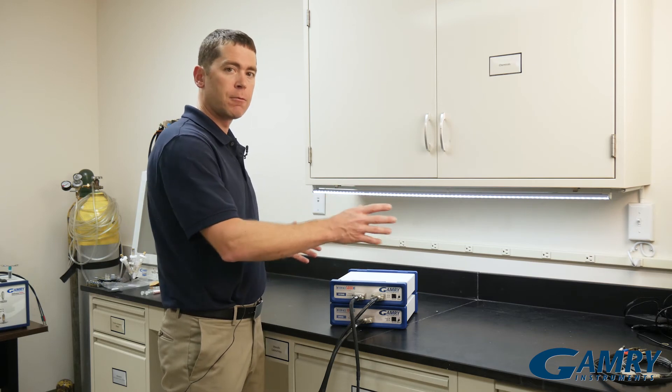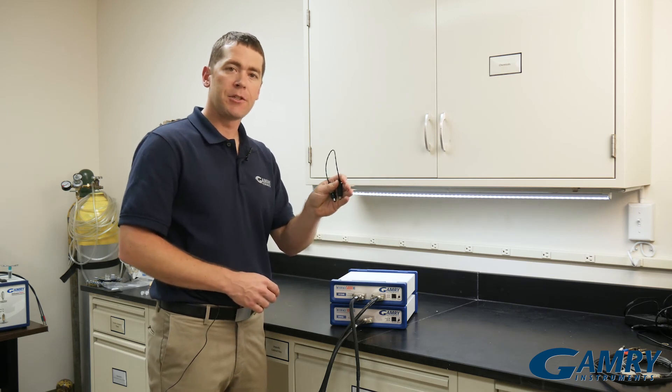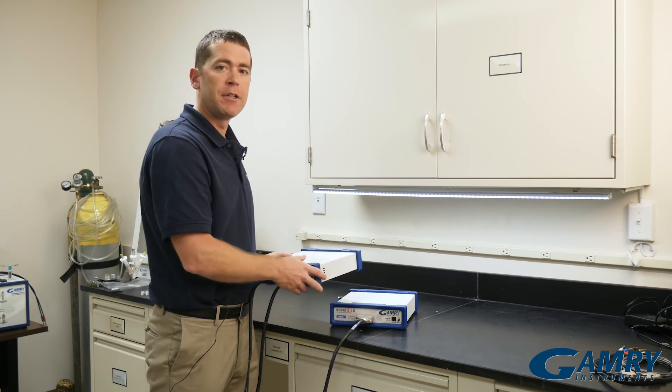When you're all finished and you want to separate your potentiostats again to go back to running individual experiments, all you have to do is disconnect your bipotentiostat synchronization cable. Then you can take your potentiostats and put them back to where they normally were, and run individual experiments.